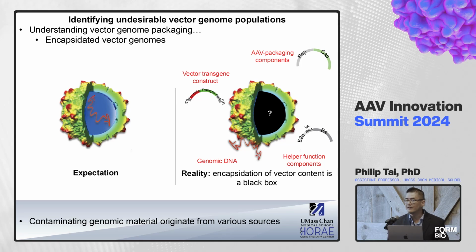When I first joined the GAO group at UMass Chan Medical School, I had a very naive understanding of AAV. I thought that whatever you design is sort of the expectation, but it turns out to not be true, right? There's a lot of heterogeneity that we see that is packaged into AAV.